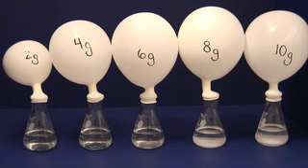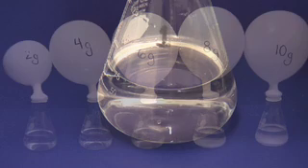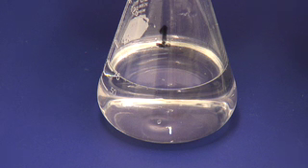Did your prediction match the results of this experiment? Let's take a closer look at the contents of each flask.